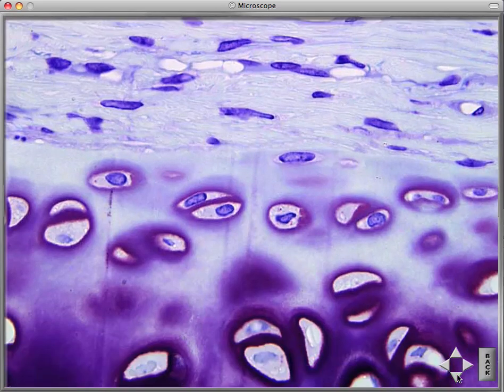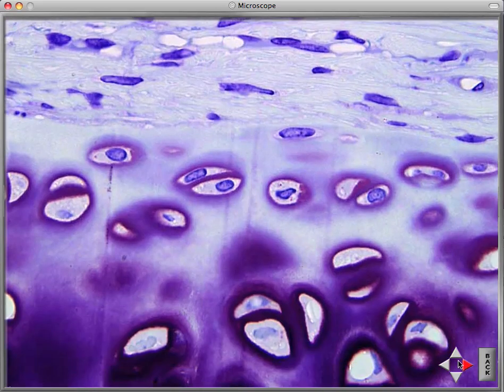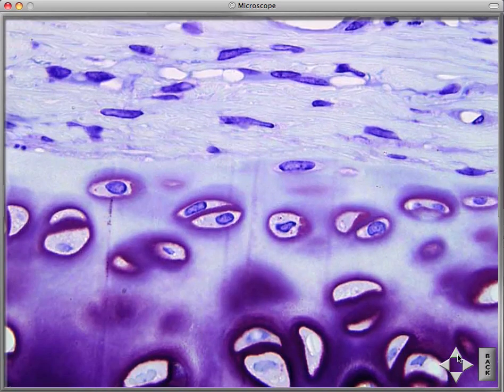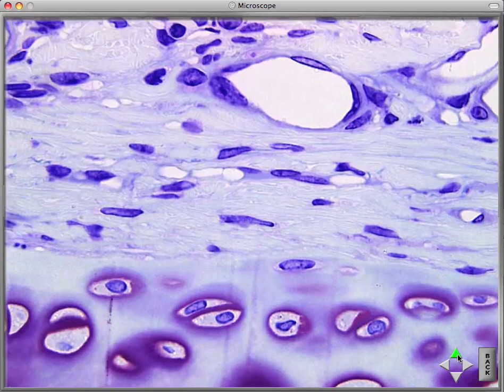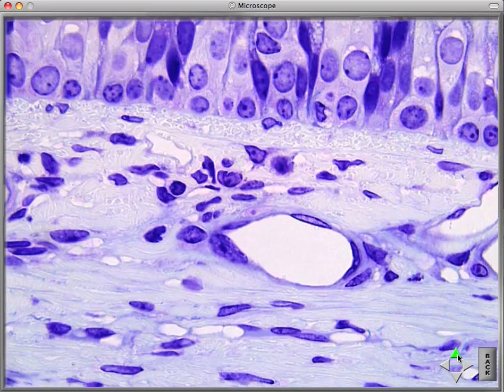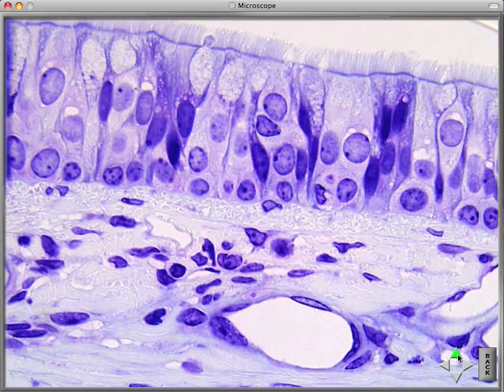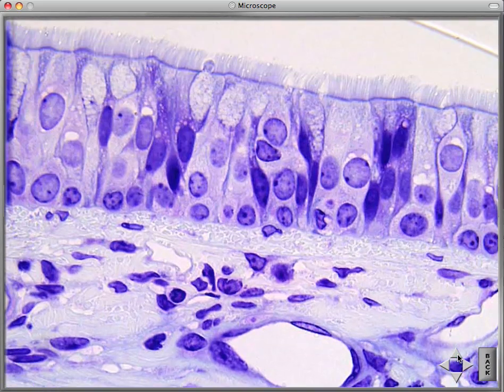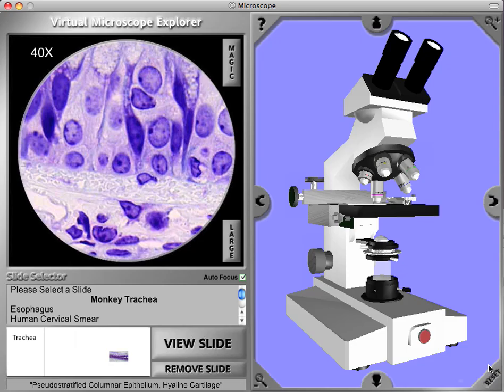Here we see a lot more detail. This was a 40x oil objective used to create the image, and we can see the cilia very clearly at this point. I hope you've enjoyed this brief tour of the Virtual Microscope Explorer program.